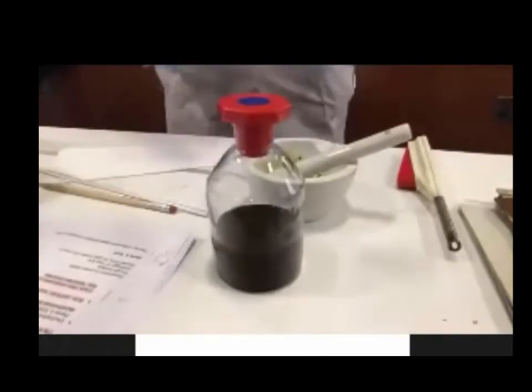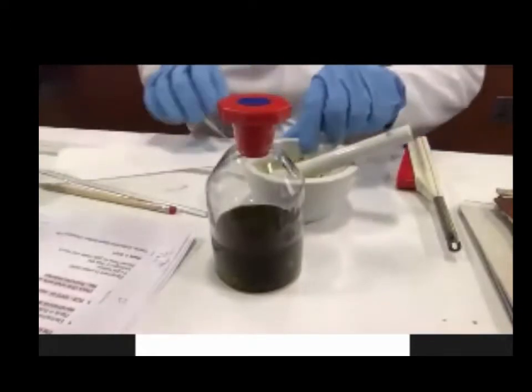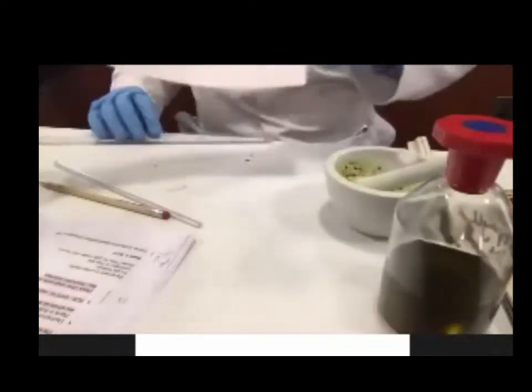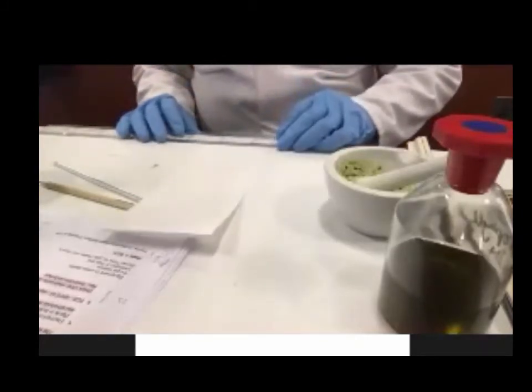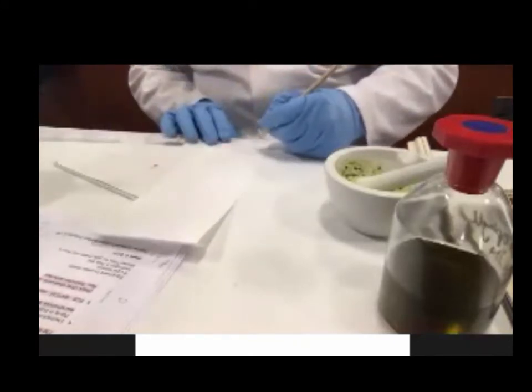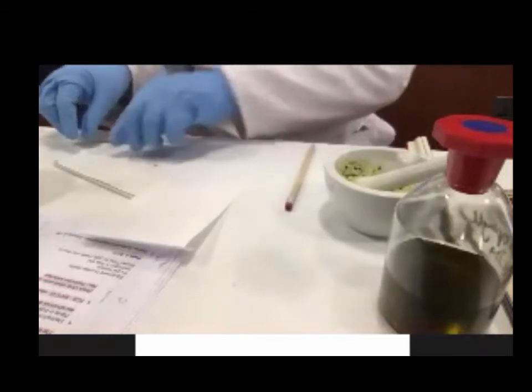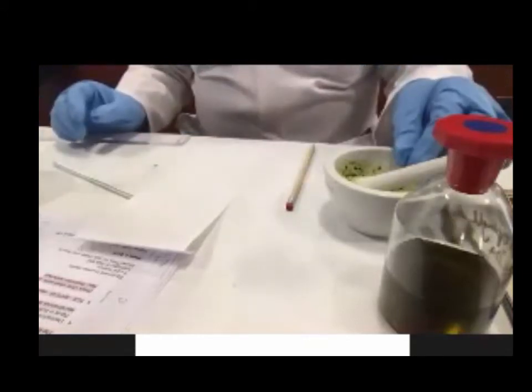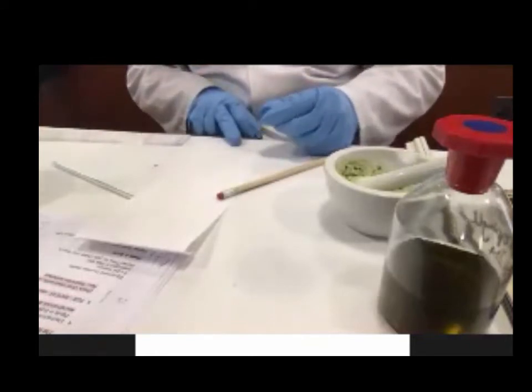Now, that's grand. So just make a ruler mark about 2 centimeters from the bottom. An X. I'm just going to do 2, and you're going to dry that.